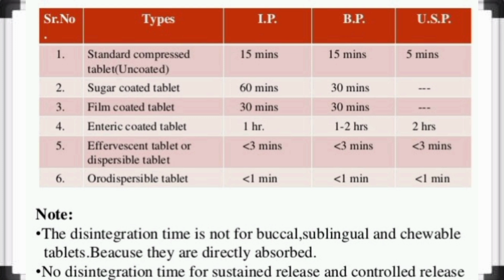DT is not for buccal, sublingual and chewable tablets, because they are directly absorbed. No DT for sustained release and controlled release.